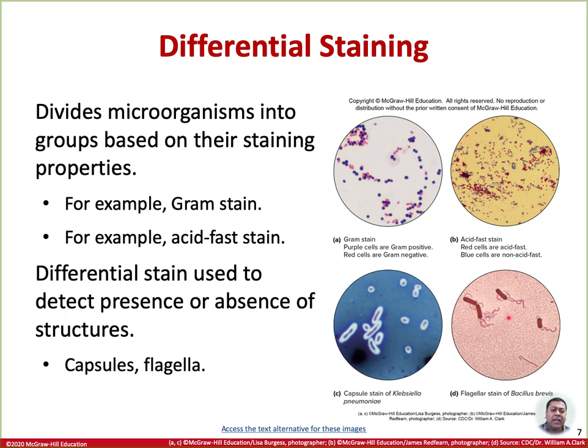Next is the flagella staining, and this provides taxonomically valuable information about the presence or the distribution of the flagella on bacteria and archaeal cells. What we mean by that is flagella are locomotory organs and fine thread-like organelles, and they can only be seen using an electron microscope, although bundles of flagella can sometimes be visualized by dark field microscopy.